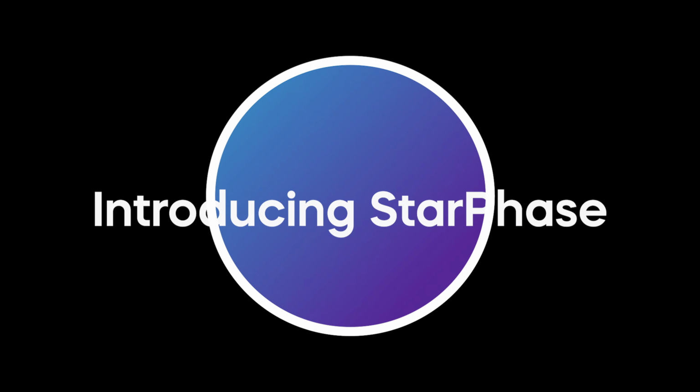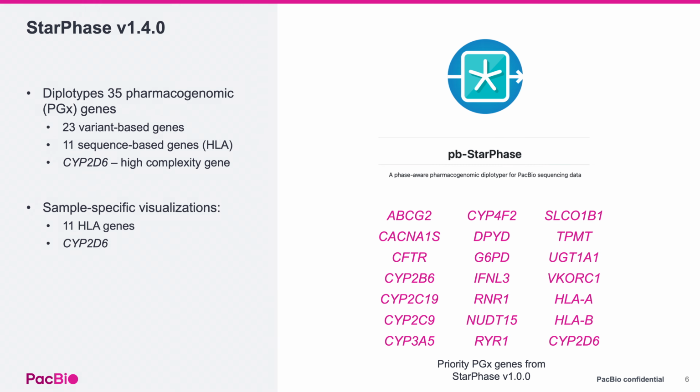The most recent version of StarPhase includes 35 pharmacogenomic genes. 23 of these are relatively simple genes based on variants that have been called by a tool like DeepVariant. These variants are phased using our long-read technology, and we can then assign those to star alleles with relative ease. 11 of them, which are all HLA genes, are more complicated, requiring StarPhase to do an assembly-like algorithm to detect sequences for the entire gene.